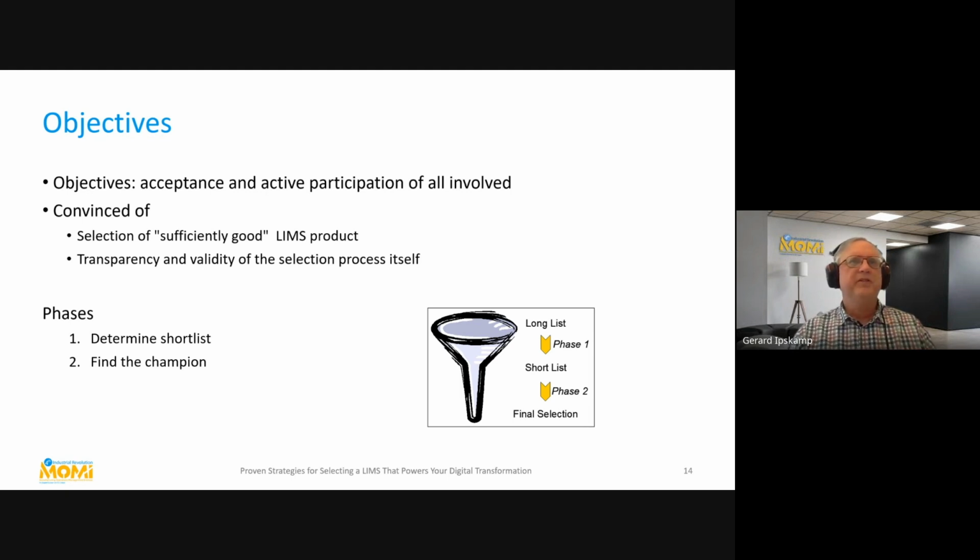And you want to have transparency and validity of the selection process itself, and it's almost 100% that either during the process or near the end, or even after the process, there's always somebody in the organization questioning the results of the selection. And if you then have a good process, you have documents, you know exactly what you did, when, why, etc., then answering those questions and countering them is quite easy.